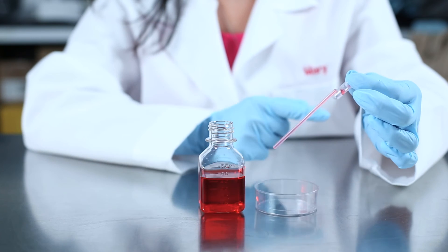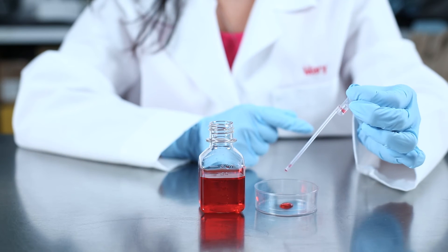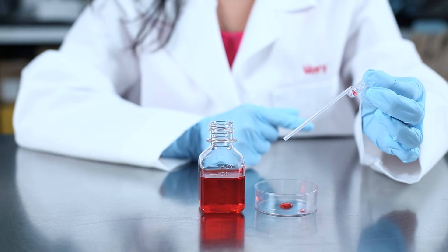The top bulb is used to draw and dispense liquid. The bottom bulb works as a reservoir to hold any excess liquid and ensure an exact volume is dispensed.